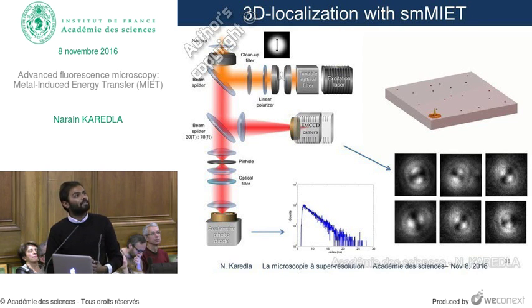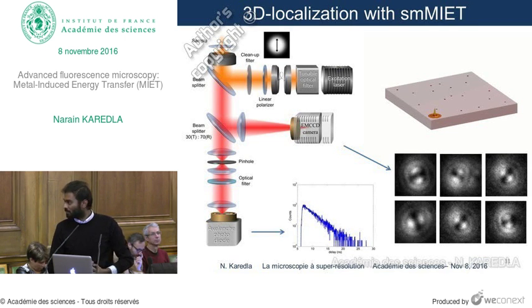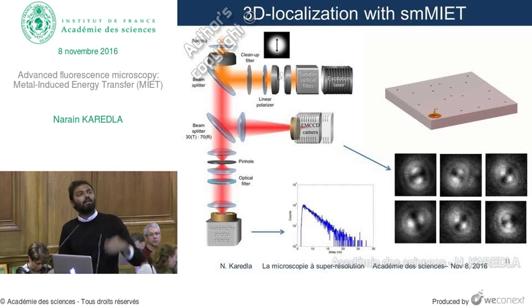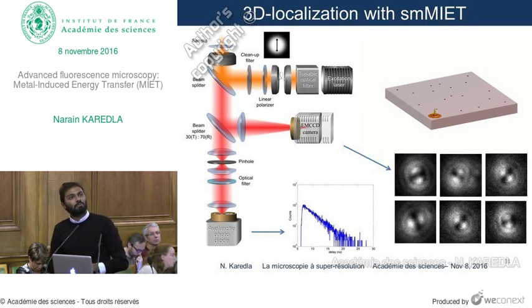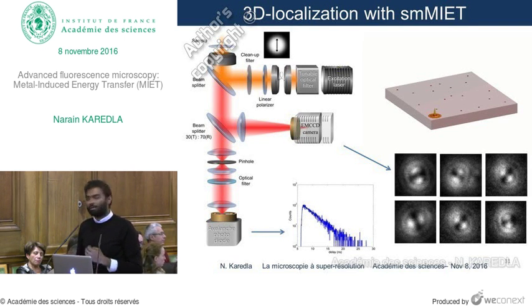And from the collection optics, you have the dichroic, which is passing the fluorescence light. You have a non-polarizing beam splitter, which sends 70% of the light to the camera, the intensity camera here. You can defocus this camera on a rail, so that you have this defocusing effect. And the remaining 30% is focused through the pinhole, so the confocal part, onto the APDs. So this part gets the lifetime information, and this part gives you the 2D defocus image. You scan, you find the location of the molecules, you go from position to position on the molecules, and you record simultaneously the defocus image and the lifetime for the same molecule. In that way, you have the lifetime and the 3D orientation information.